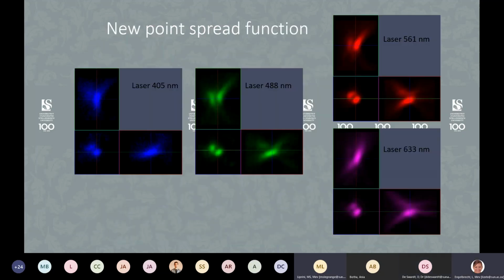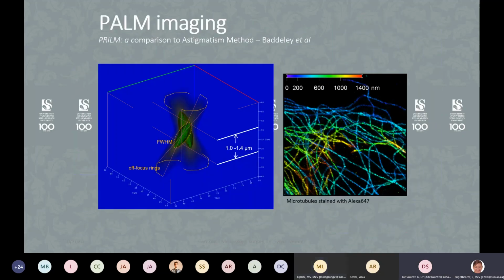I'm going to show you one slide quickly. You would need to get your sample down to about 1.4 micrometers. The 3D palm is limited in the way that you can really only resolve 700 nanometers above and 700 nanometers below the focal plane. Your samples, I know, are unfortunately too thick. So if you can get them down to 1.4 micrometers, and the reason I'm saying 1.4 is that you don't want any other fluorochromes or molecules above or below the focal plane to distort your images.